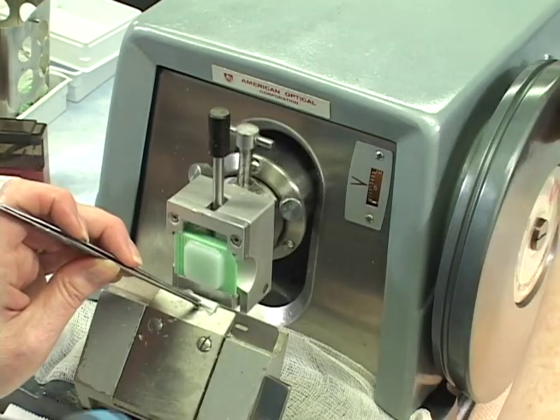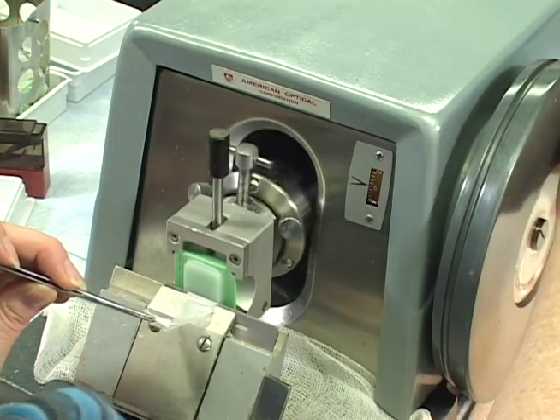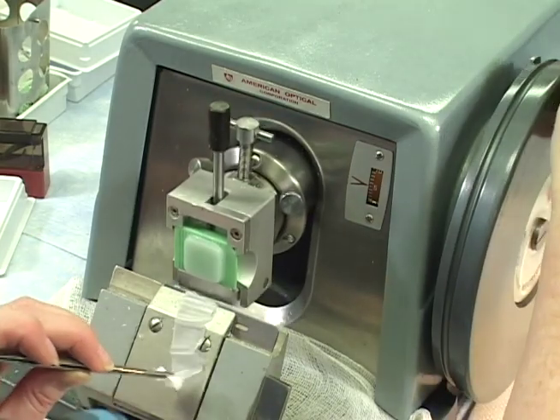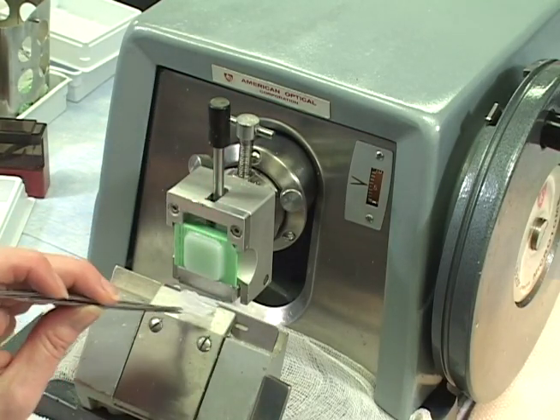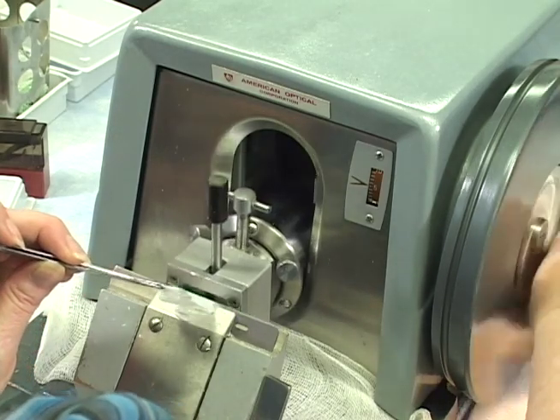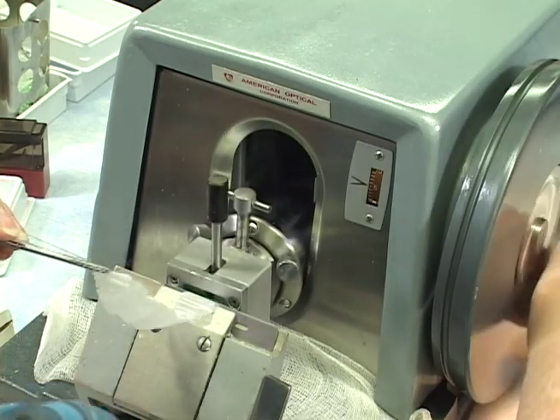So now I got a little bit of paraffin on the bottom there to grab onto. And it's making a very nice smooth ribbon. And you know, your stroke is everything on these. This block is not even chilled or anything, so that makes a difference. So we got a nice ribbon.